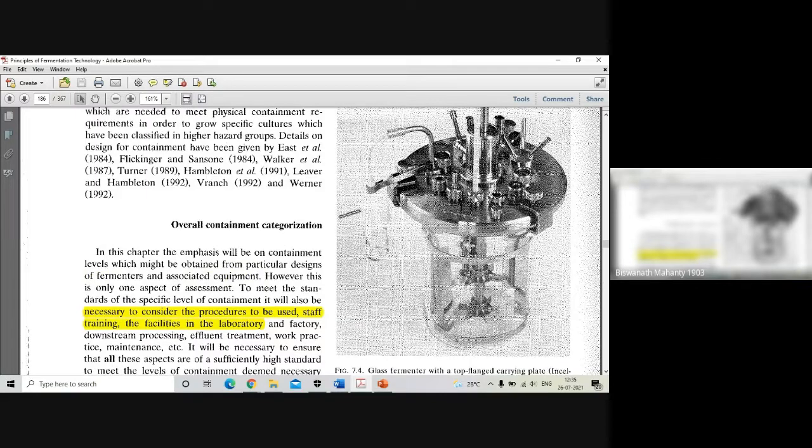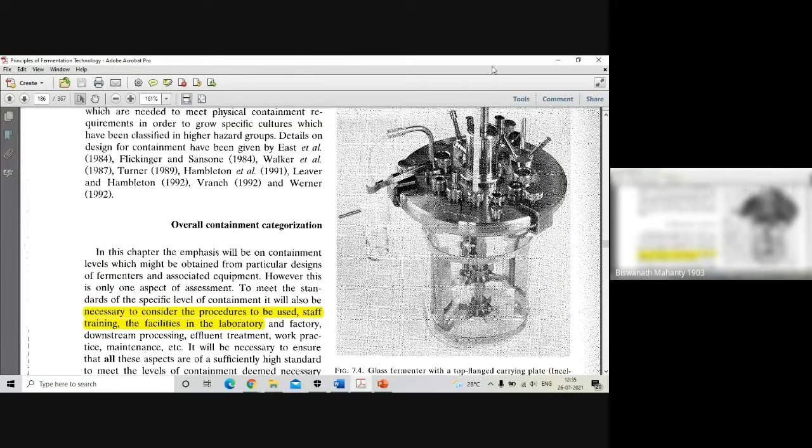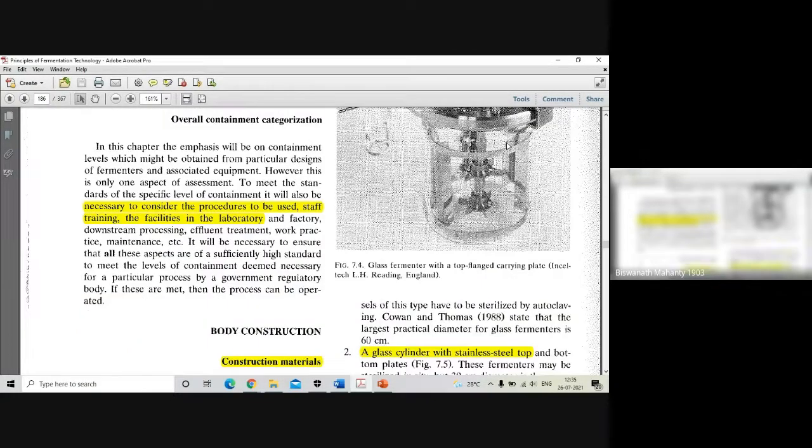This looks like we have used a similar kind of fermenter in our lab. So how we are taking the samples, how we will allow the inoculation, considering these kinds of precautions, how can I deal with them is actually available, or we can have the facility in a fermenter also. We should follow the same procedure when I am going to adapt this in a fermenter.